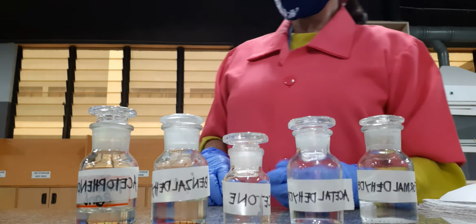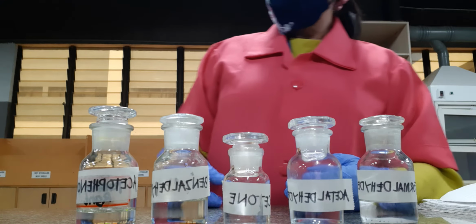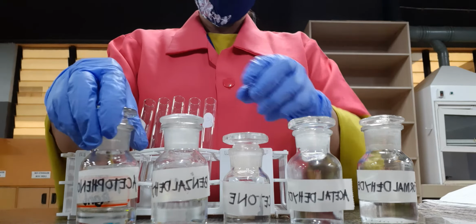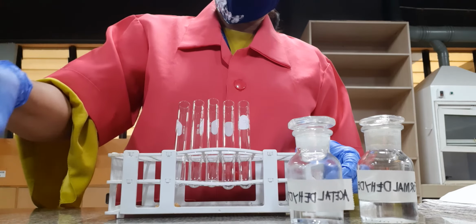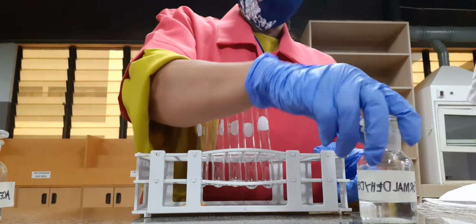We'll take a sample of these reagents into each of the 5 test tubes and add water. So you have to determine what will happen.